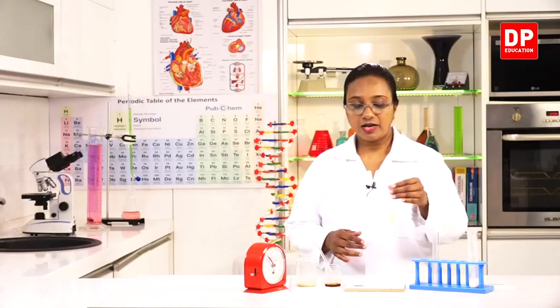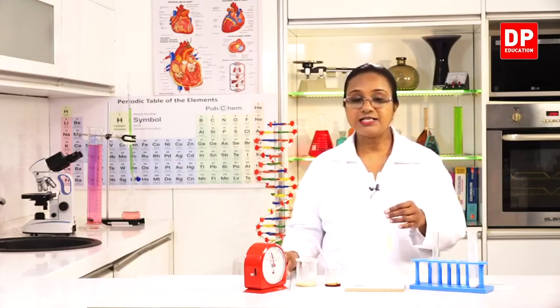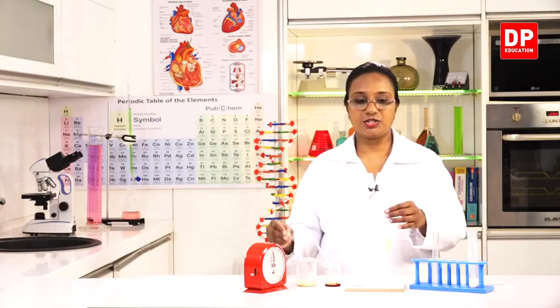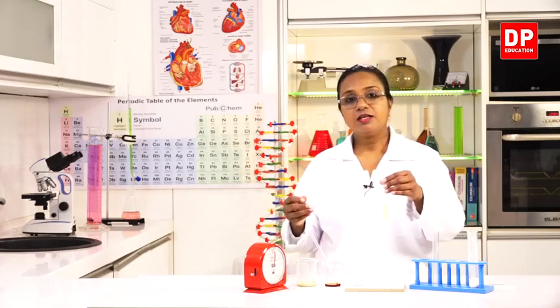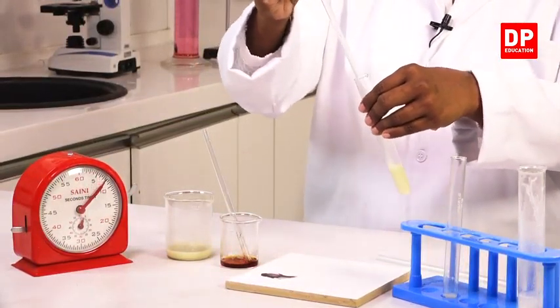Now, we will get ready to take the first drop from the mixture and test for the presence of starch. So, I have the starch amylase mixture. Now, 2 minutes is up. I draw a drop from it.